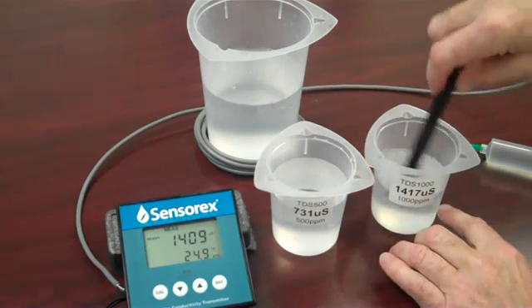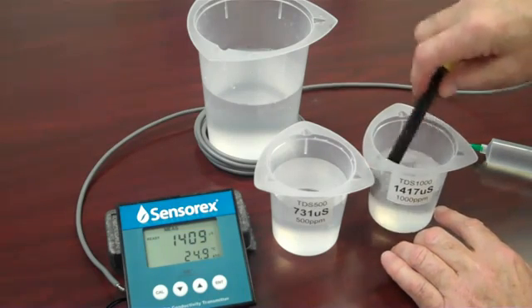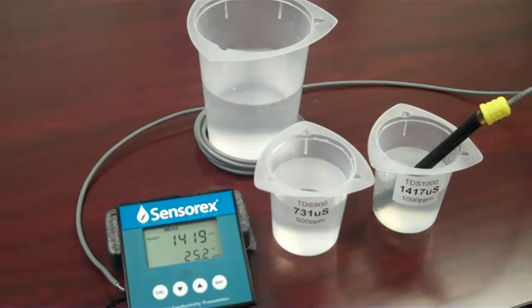Again, stirring the solution to provide stable readings. My meter has stabilized. I'm reading 1,419 microsiemens. The standard is rated at 1,417 microsiemens, so there is very excellent agreement.